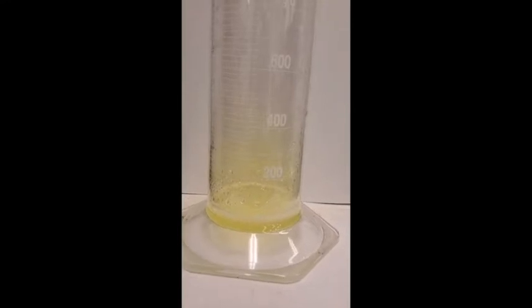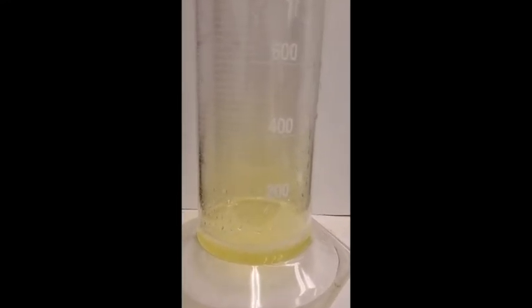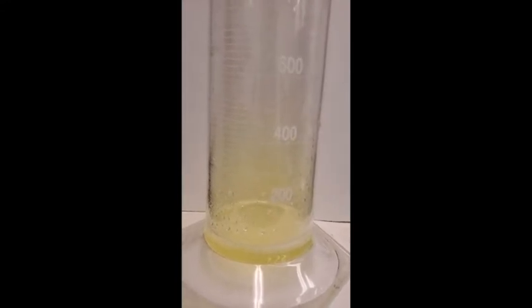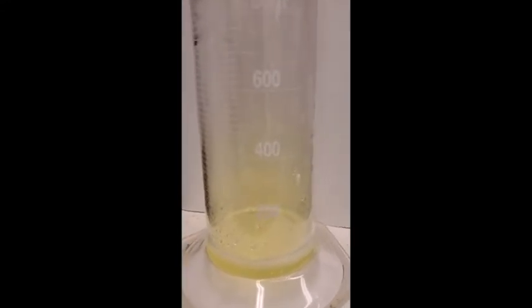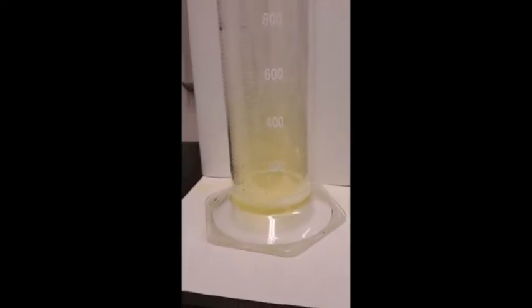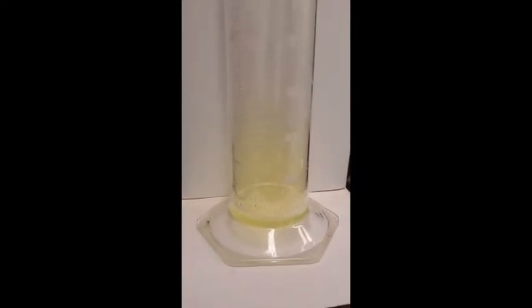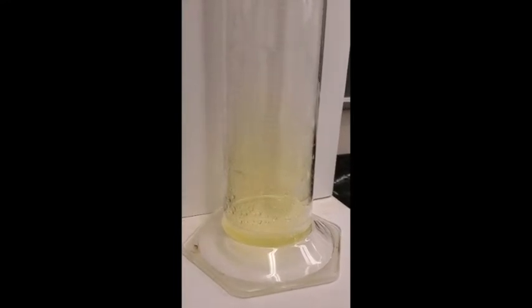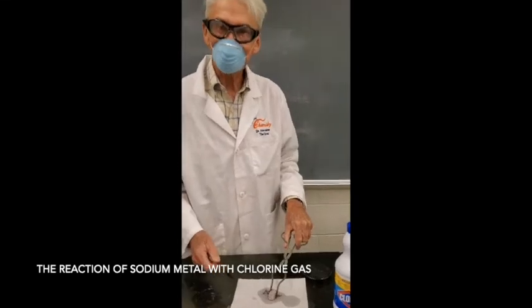It is green, isn't it? Can you see it? Let me go turn around here so I can see it too. Yep, you can back up a little bit so it's all at the bottom. And that's what's saving our life. It's a dense gas. It's a yellowish green gas. That's chlorine.